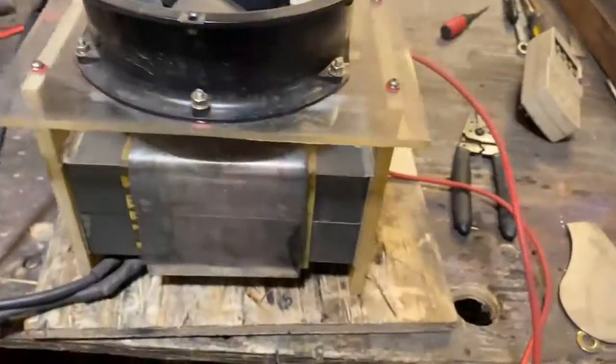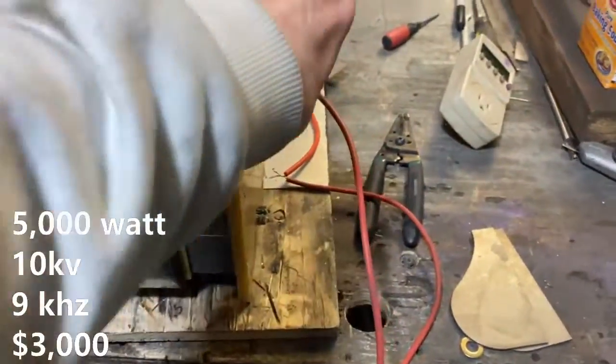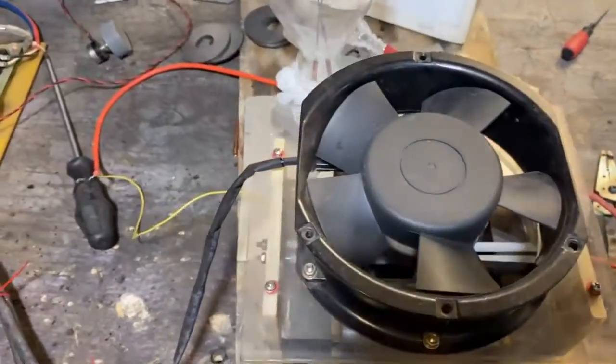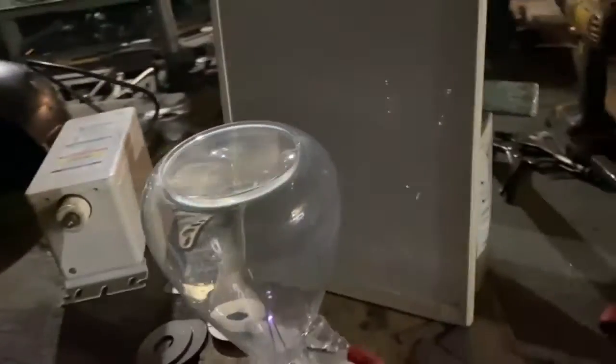So this is the transformer here — it's a little dirty, it's been sitting next to the plasma table for two years. This is the driver for that transformer. We're on low power, started off at about 66 watts, now down to about 20 watts. I can hear a cooling fan on that thing roaring. It's giving us that intense little blue beam there.